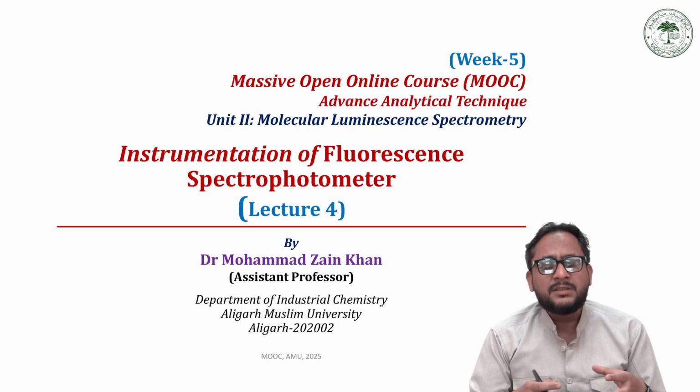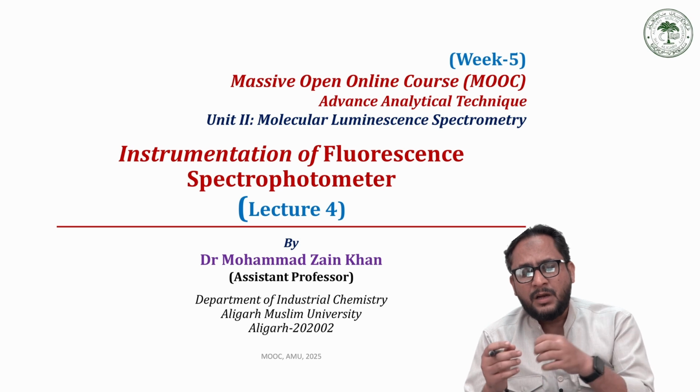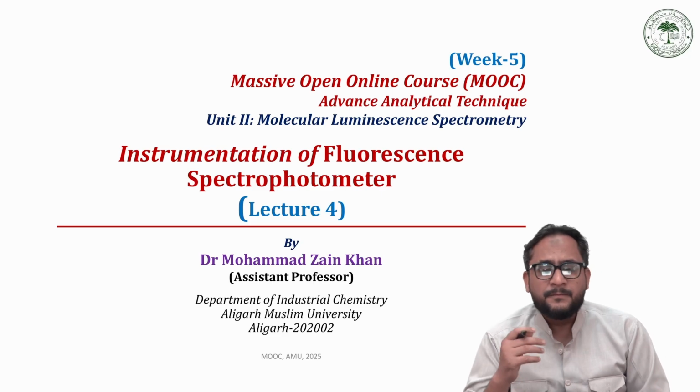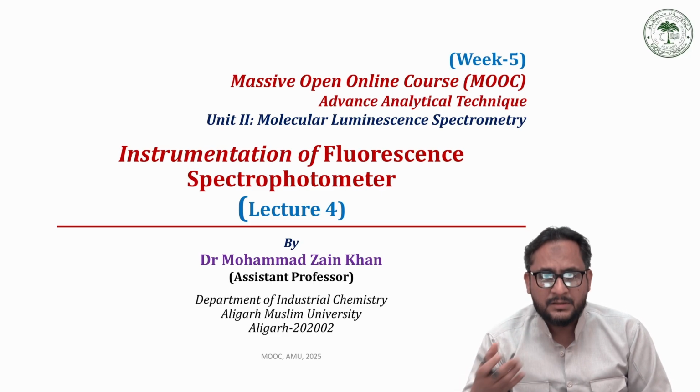So we have discussed how a spectrum is generated in a spectrophotometer. In today's lecture, we'll discuss the individual components in more detail. We will start this discussion with the light source.